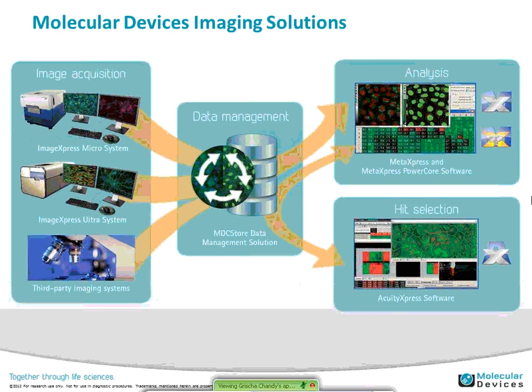So next is, it's not just about the images, it's what you do with the images, and I'm going to go through a little bit about MetaXpress and MetaXpress PowerCore.